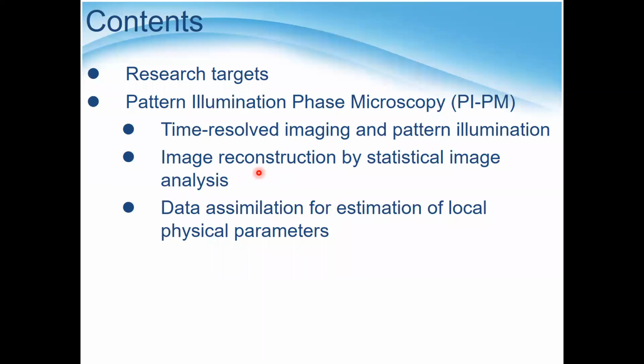So the next step is image reconstruction by statistical image analysis. Of course, we can obtain the response, but usually the refractive index change due to the charge carriers is very weak. So we utilize up-to-date image recovery algorithms to make the image very clear and obtain the refractive index change. I'm going to introduce some of the methods for this.